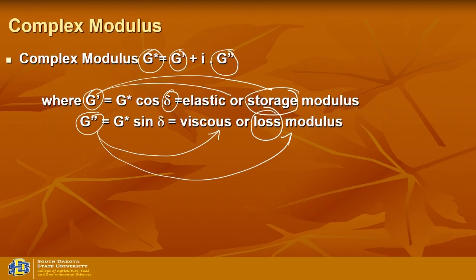So in essence, what you get from the instrument in the test is the complex modulus and the phase angle. Then the computer uses this relationship to give you the storage modulus values and loss modulus values. Because you know the relationship and the software takes that into account, you get the storage and loss modulus. So in essence, what you are measuring is the complex modulus and the phase angle. From there, our system is calculating the storage modulus and loss modulus for you.